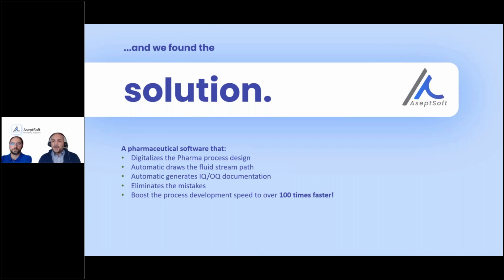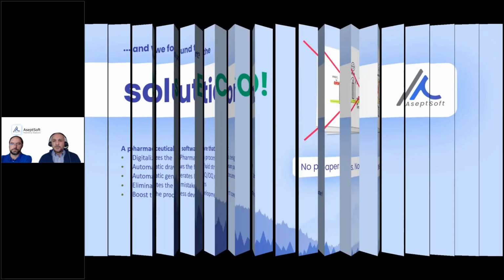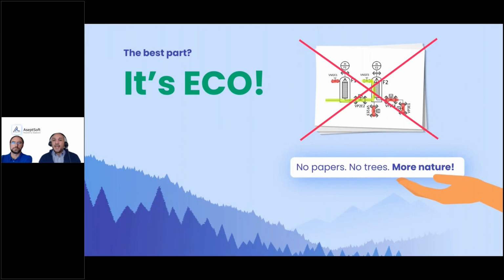So we created a pharmaceutical software that fully digitalizes pharma process design, automatically draws the fluid stream path, automatically generates IQ/OQ documents, eliminates mistakes, and boosts process development speed to over 100 times faster. It is eco-friendly because every license is eliminating the need to print a lot of paper, saving in this way a lot of trees.